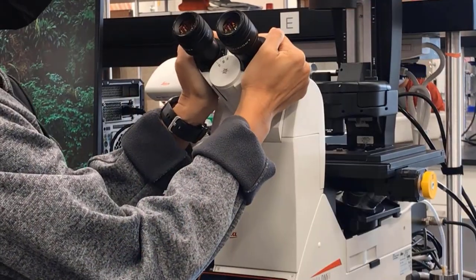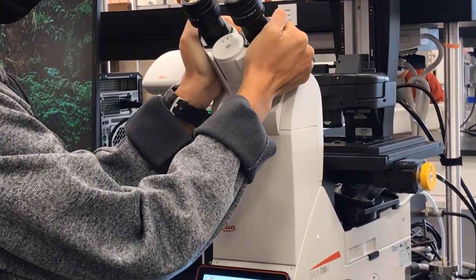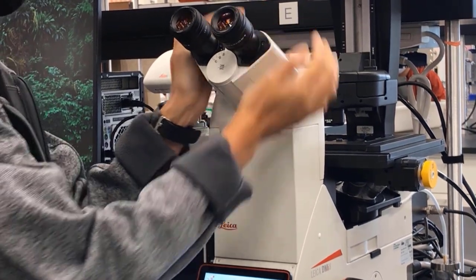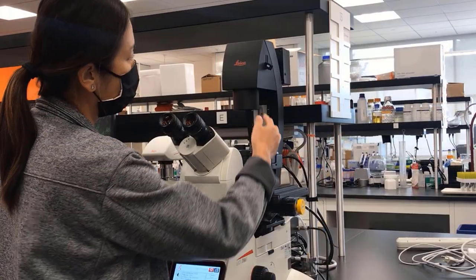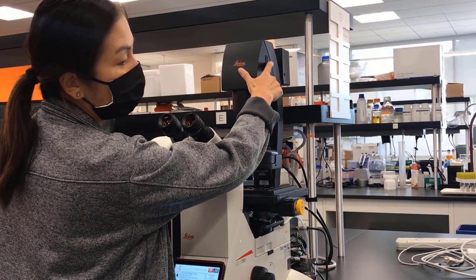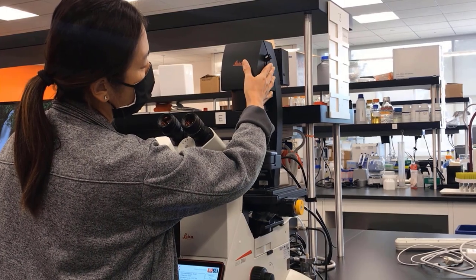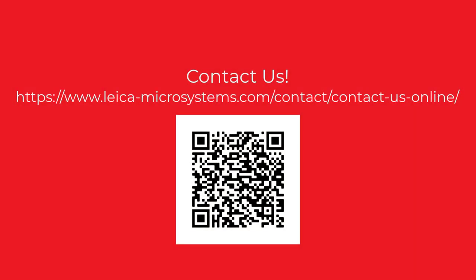The eyepieces are tiltable, so please adjust them to a comfortable height. You can also adjust the intraocular distance. The eyepieces themselves are also adjustable depending on your eyesight. A quick troubleshooting tip: these two flaps should always be down. If they're up, they will block the light, so make sure that they're down. That concludes this video. If you have further questions, please contact us.